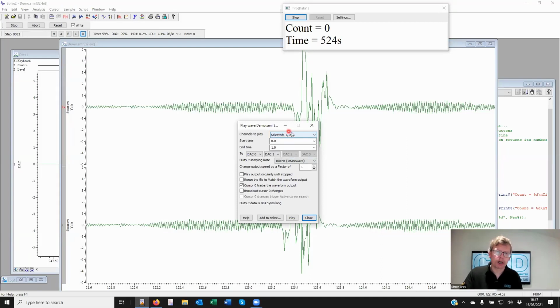Now I have two channels, and I can select the range, X low to X high, or specify a time by typing it in, or use vertical cursors. And the DAC outputs are then enabled for me. Well, more than one DAC output is enabled for me. Okay, the two channels are sampled at the same rate, 100 hertz. Well, this could be 1000 hertz, could be 10,000 hertz.